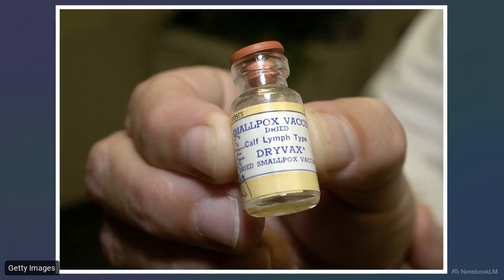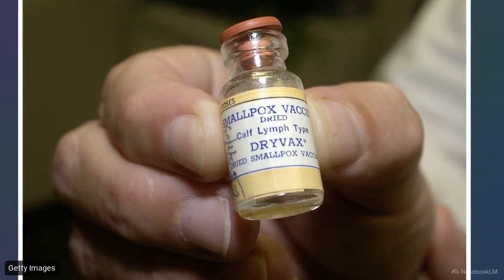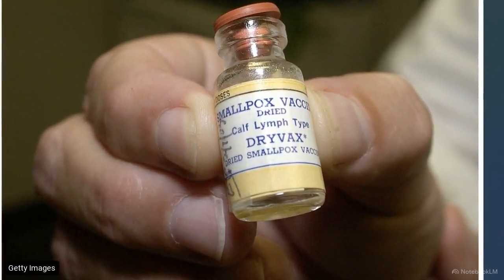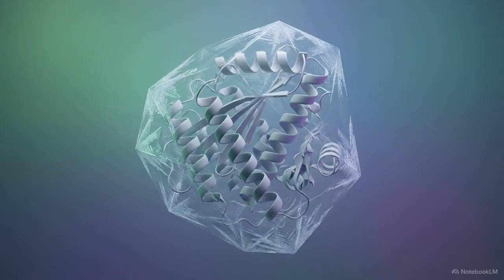The critical nature of this technique is evident in biological preservation. This historical vial of dried smallpox vaccine remains viable specifically because it was lyophilized. For biologicals, bypassing the liquid phase through sublimation is the only physical method to preserve complex molecular integrity.